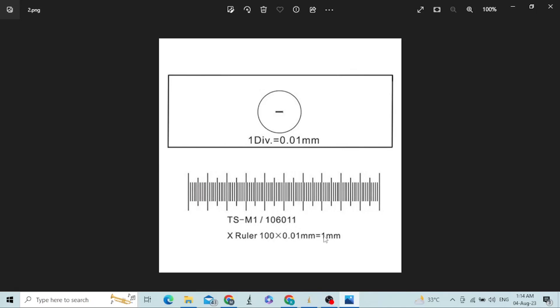When we multiply 0.01 millimeter with 100 divisions, we get one millimeter length, which shows that the total length of the stage micrometer is one millimeter. However, the distance between two consecutive large divisions is 100 micrometers.